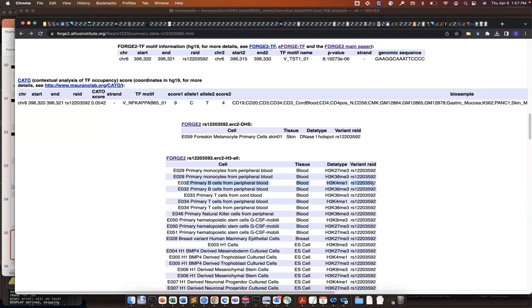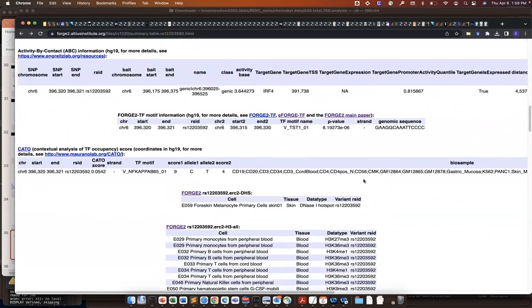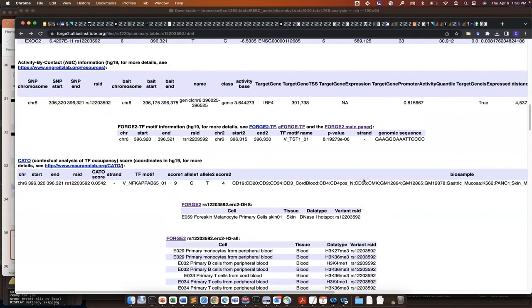If you look at your variant, which has a 10, the best score, you'll see it overlaps active and repressive marks. In one of the monocyte data sets, it overlaps 2 marks, because you have overlapping histone marks. It overlaps a repressive mark and also a transcription mark, but mostly a repressive mark. But in another data set, for example B cells, it overlaps an active mark, H3K4 mono-methylation. So for different cell lines and tissues, one cell line's repressed region is another cell line's active region.